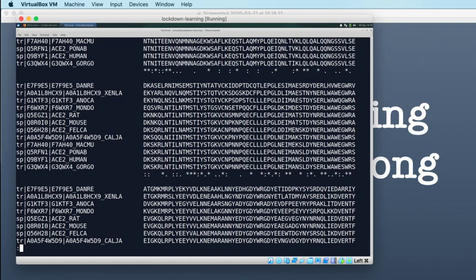When I looked at the sequences that we downloaded yesterday, and at the alignment that we constructed yesterday, with a critical eye, we could see that it wasn't quite right. The thing that we'd produced wasn't really what we expected. Particularly, one of those proteins didn't seem to be annotated as being an ACE protein. It had a different name. And the other thing for me was that it came from an unexpected organism.